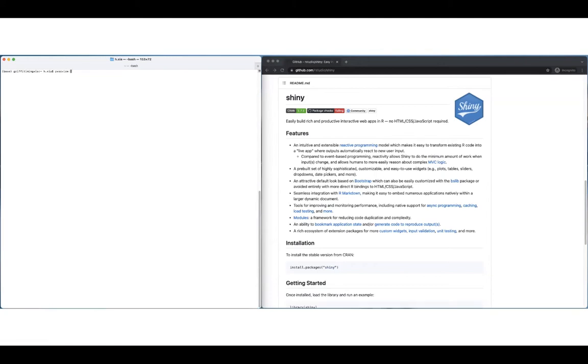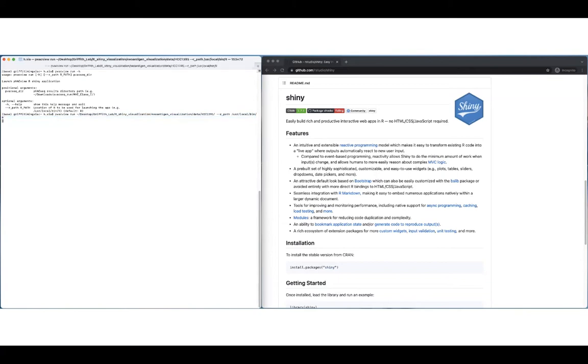In Terminal, we can first check the necessary inputs to the pVACview command. As you can see, in order to run pVACview, you simply need to supply your pVACseq results directory. There is also an option to specify the location of R to be used for launching the app. This is convenient in cases where you have multiple versions of R installed.